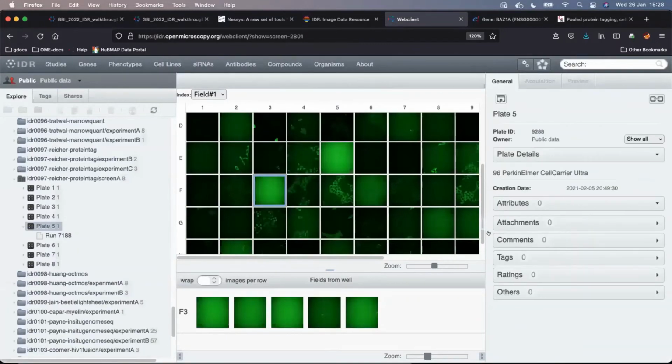Sometimes the plate is indeed submitted as one unit, as I was suggesting in my speech. But sometimes this one unit comes into fruition only after an effort and an interchange between the curators and the submitters, because not all plates are as beautiful as just suggested. So that's the reality. Maybe that's the fair answer to your question in the chat.